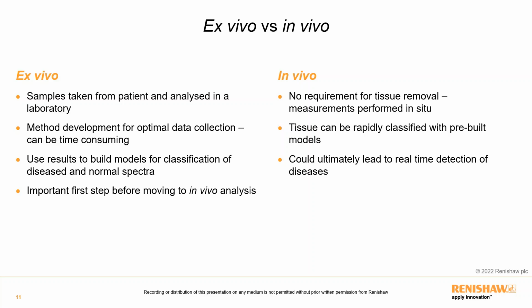In vivo measurements are when data is collected in situ, meaning there is no need for tissue or sample removal.